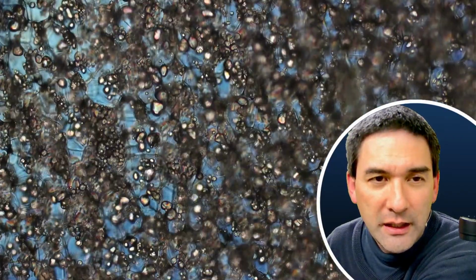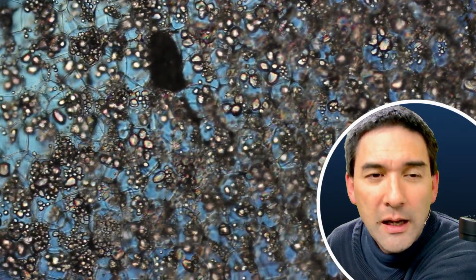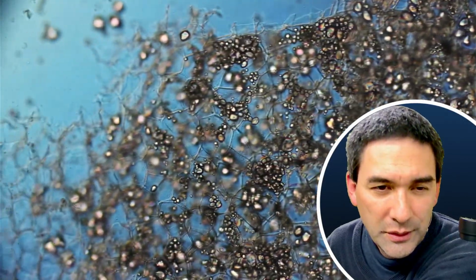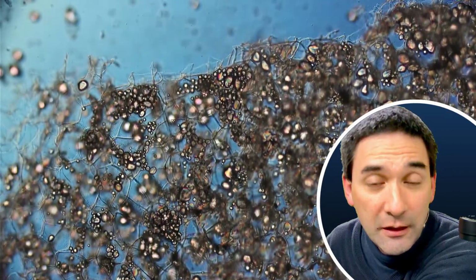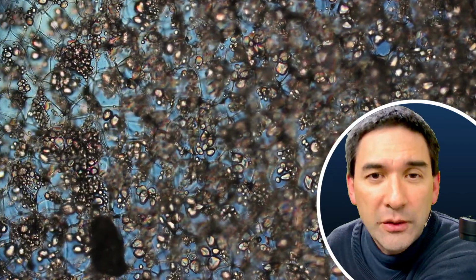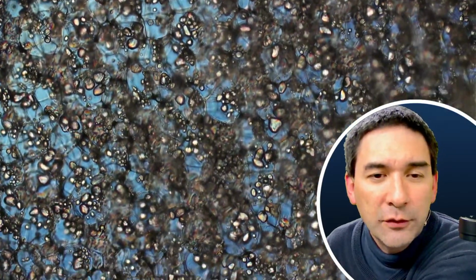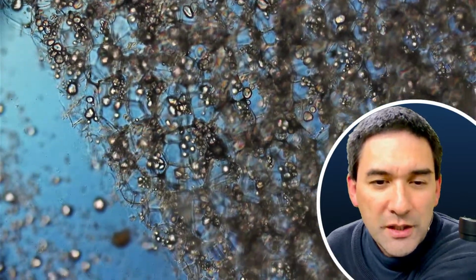The iodine that I have is very aggressive. If you spill some of it or get it into contact with the microscope optics, it will corrode. What you can do, however, is stain the specimen first and then wash everything in water to remove any excess iodine. The iodine that goes into the starch will be bound, so that should not be a problem, but any excess iodine that might spill out from behind the cover glass will be removed. That's something I would recommend.